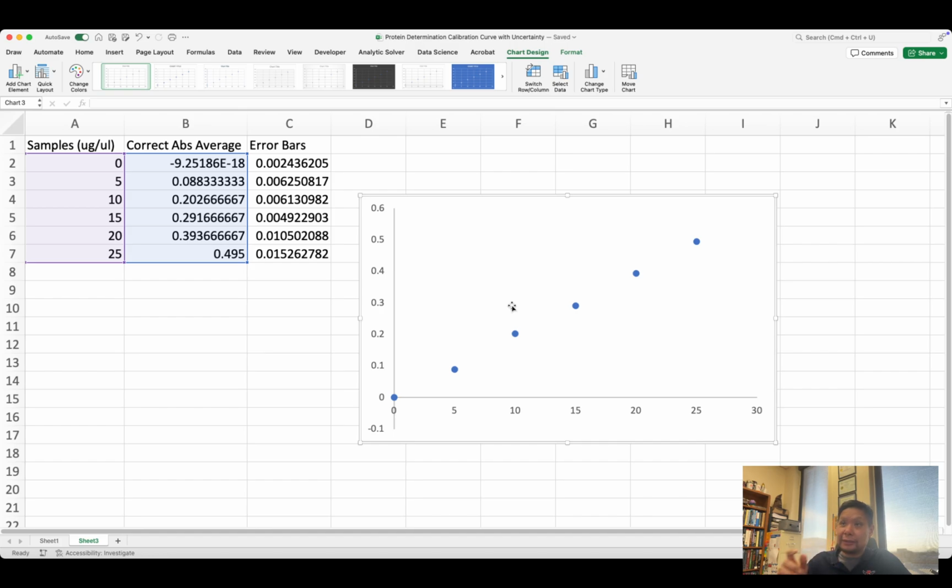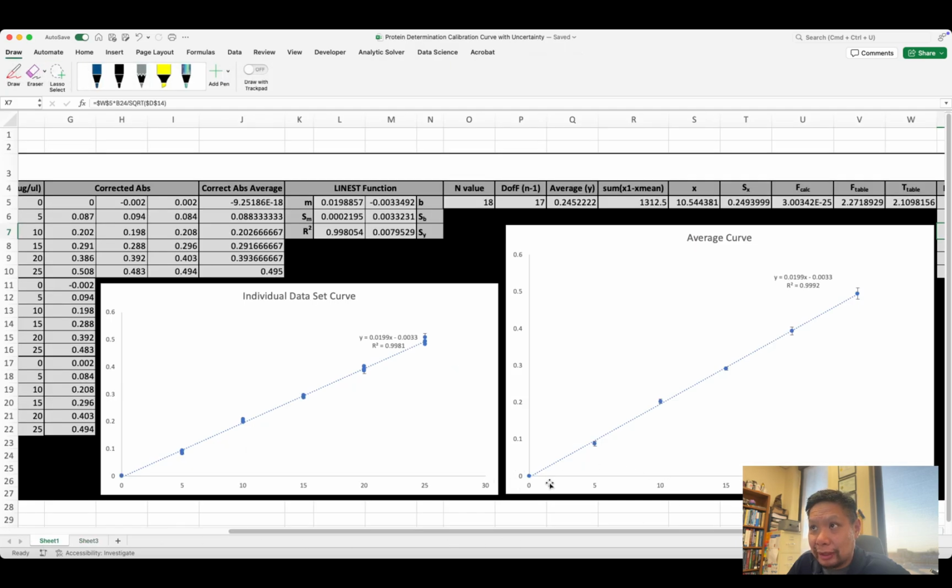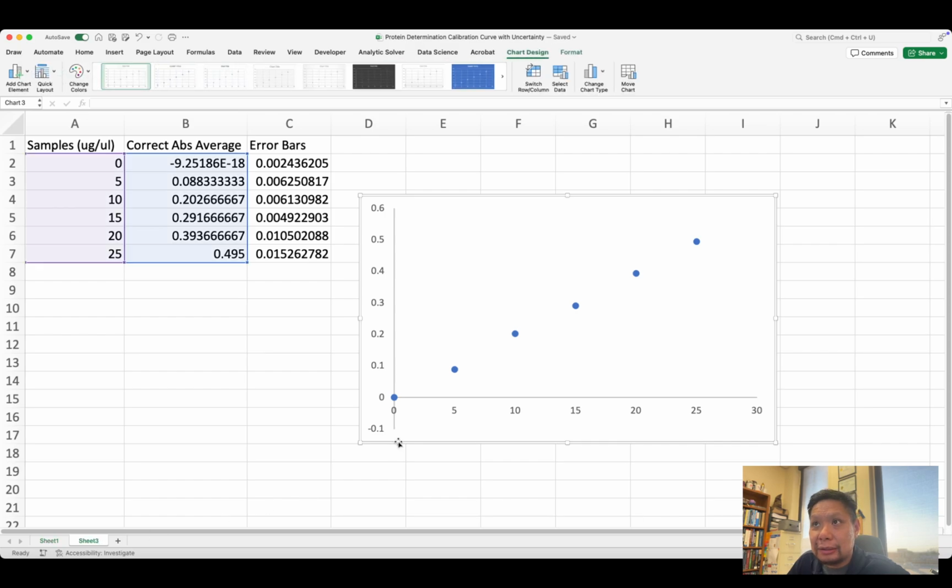And so now that looks better, right? I'm even a little iffy about this little guy down here. I don't like that little guy down here, right? Because you can see how I actually got rid of that little guy down there. But I'm a little iffy about that, but that's not super important, okay?